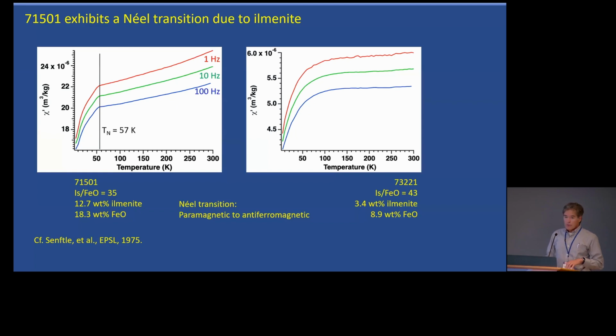We see only the superparamagnetic or single domain. The other thing you'll notice here is that there is no peak maximum in the AC susceptibility, and this is implying, like the other bulk measurements, that this is single domain ferromagnets. They do not relax against an alternating magnetic field.